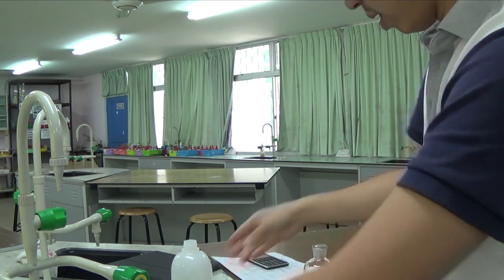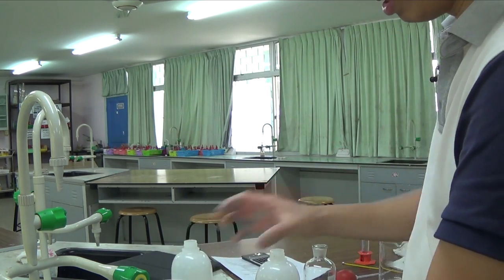So I'm just going to chuck this away now, rinse it with some distilled water.